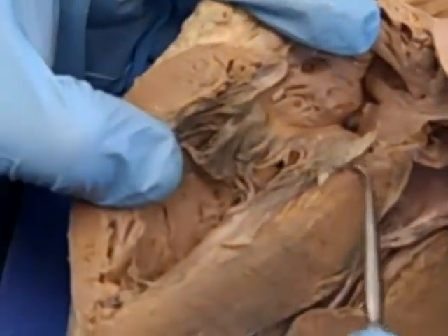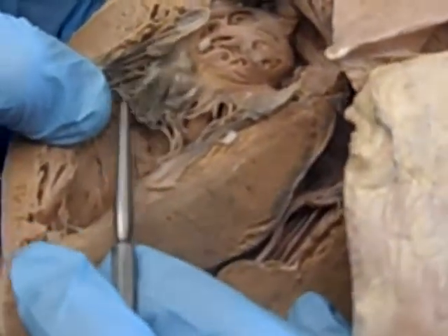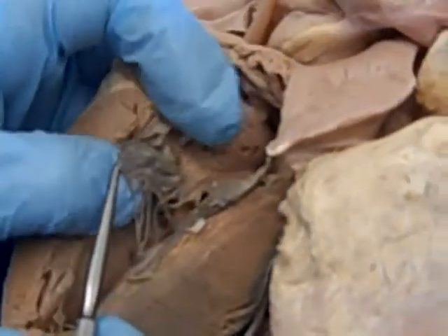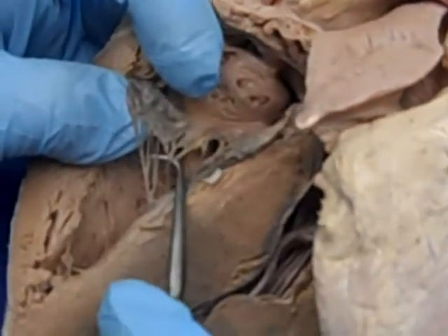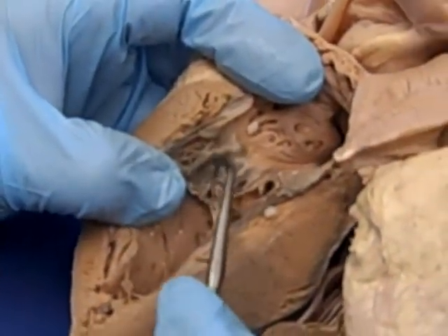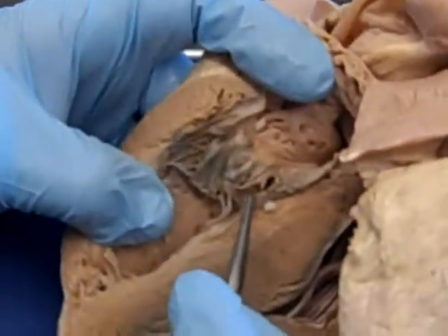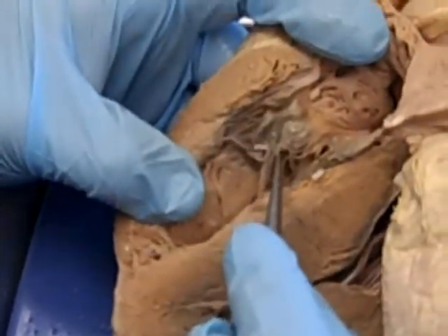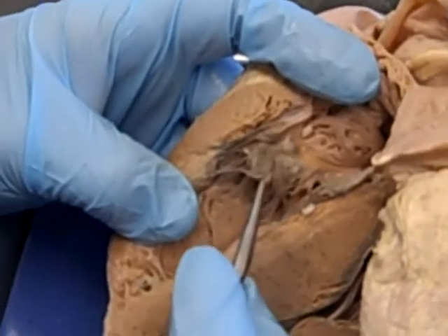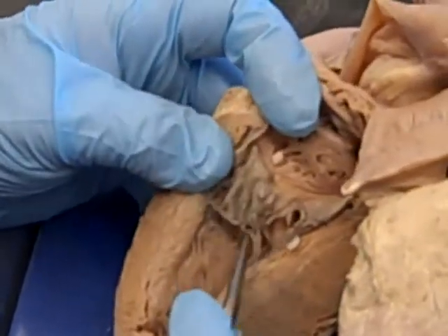Looking at that valve, it sort of looks like a trampoline, and if you pull it a little you can see it has small cords attached to it. This is the tricuspid valve — it has three cusps and is an atrioventricular valve. These cords are the chordae tendineae, which keep the valve from prolapsing back into the right atrium when pressure builds up in the ventricle.